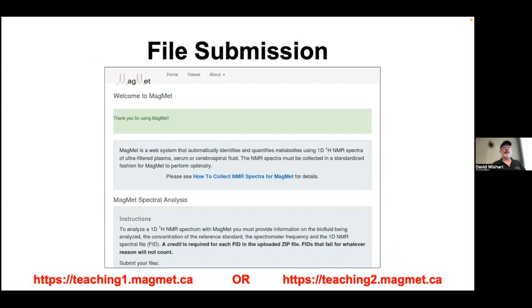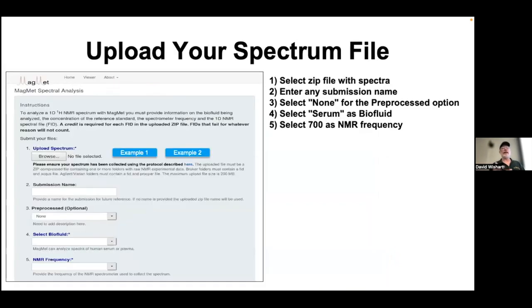You're going to select your zip file, enter a submission name, and select none for the pre-processed option. Because we're analyzing sheep serum, that's your biofluid. The data were collected on a 700 MHz NMR instrument, so choose 700 — don't choose 600, don't choose 800. And make sure you choose serum, because that's what you're analyzing.